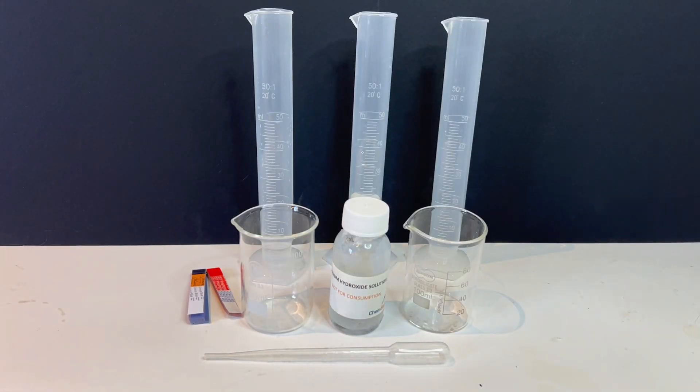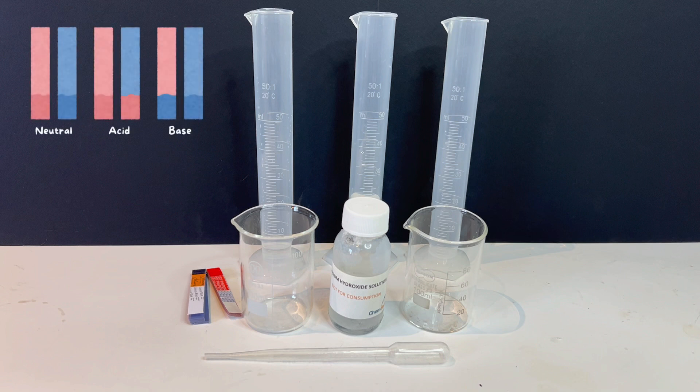We are going to use litmus paper to test whether substances are acidic or basic. Litmus paper is an indicator that changes color depending on the pH of a substance. Blue litmus turns red in acids and red litmus turns blue in a base.